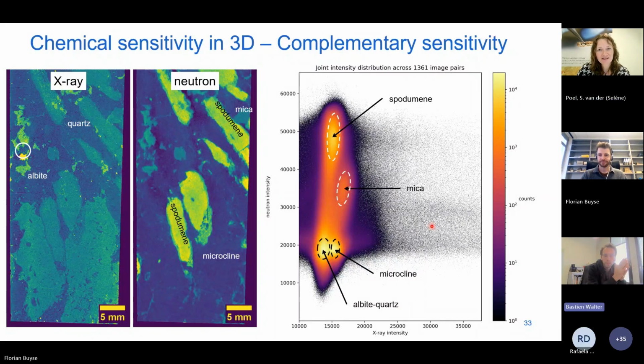Yes, hello. Thank you very much for the presentation. I was reading yesterday your paper from 2025 about spectral XCT. I have a technical question, because in your presentation and in the paper, you are showing attenuation profiles. I don't know which software you used, but you're able to select one specific voxel, and for each voxel you can plot an attenuation profile. Is that right?